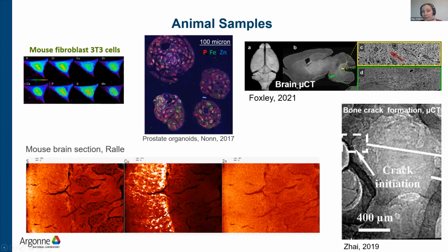And on the top right, you can see a brain micro-CT tomography, which was done in collaboration with Bobby Kasthuri for brain connectomics visualization, for tracing neuron bodies through the slab.